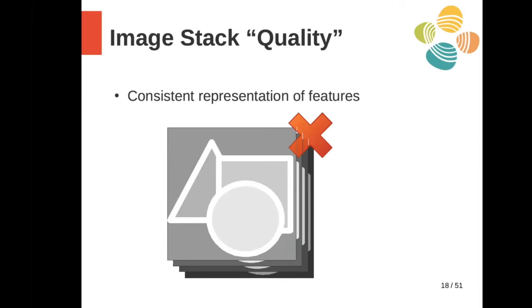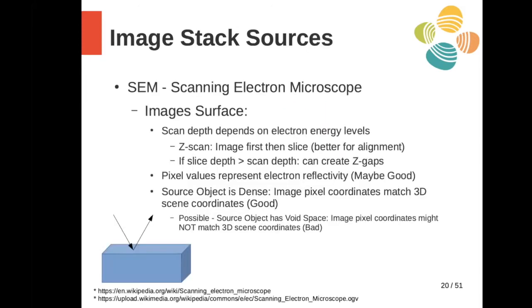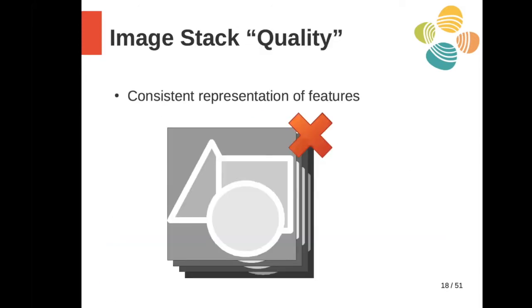You know, one corner tends to be brighter than another. We'll see some examples of this later on as well. But I'll bring this to your attention here because these are different layers, we may not notice. Our visual system is very good at correcting for these sorts of differences, but the algorithms are really looking at absolute intensities as opposed to relative ones. They will have difficulties determining that we are still dealing with the same object.